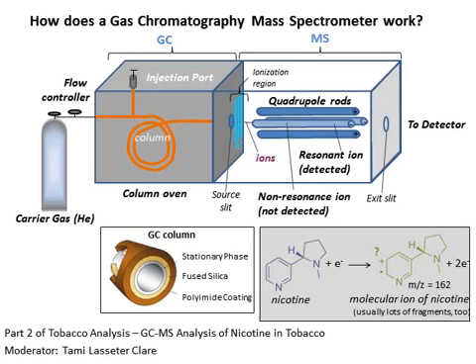And so we're often interested in the fragmentation pattern that's produced by the mass spec because molecules form a pattern that is characteristic of each individual type of molecule. And these days it is possible to do a library search within the computer database against files containing mass spectra of many different types of molecules, and then the search results return good matches, and it's fairly easy to sort through those to identify the likely molecule if your sample is an unknown.